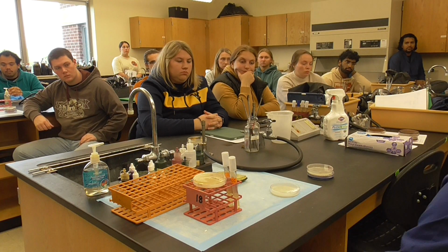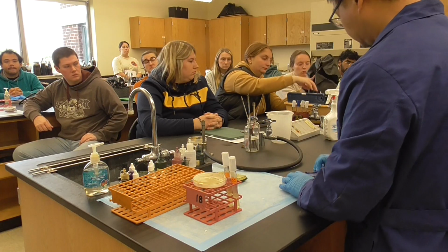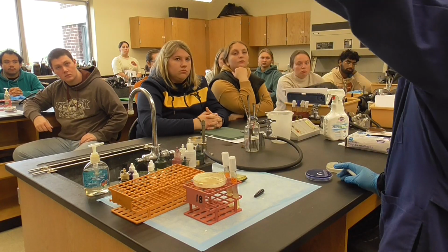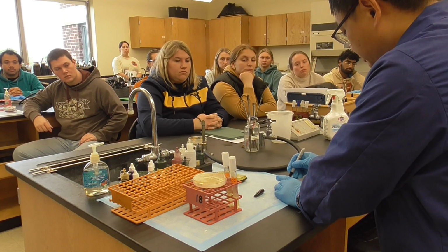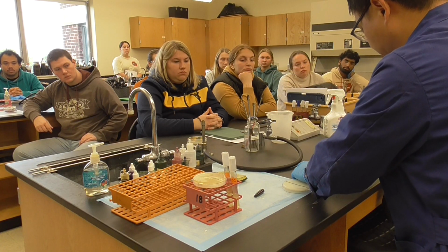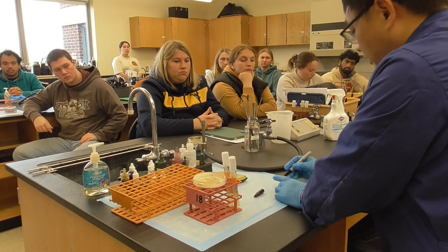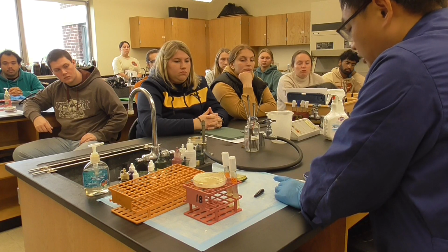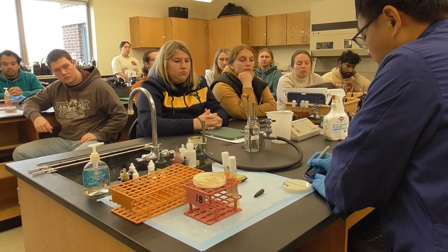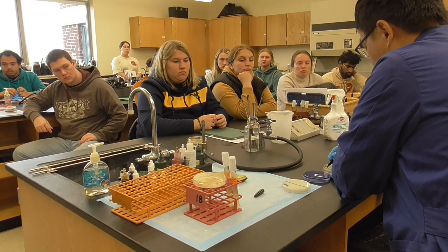So we need somebody with a Sharpie pen. Do you have a Sharpie pen? Okay. Skim milk agar, split into 2. Blue agar, split into 2. Starch agar, split into 2. So write your bench number, initials, and date. That's very important, the first information.